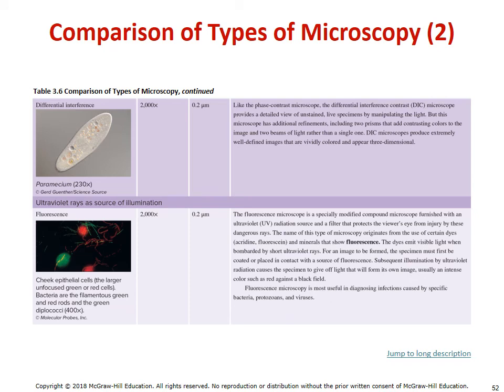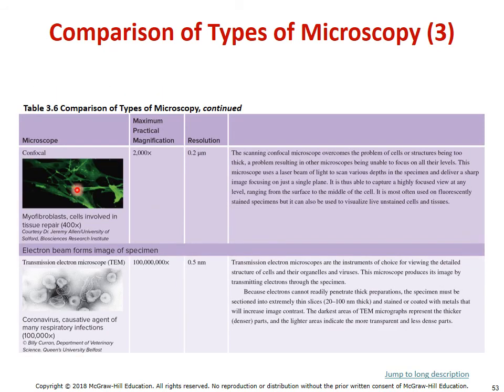But with fluorescence and confocals, we actually see a situation in which we have cells that are colored, and these are purposely colored. What's interesting about fluorescent and confocal microscopy is we use stains that can be excited, creating basically light. And so these things look like they light up on that background because of the fluorescent or confocal energy activating the electrons of that stain.